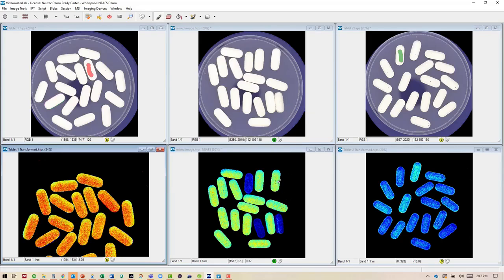By teaching this system, we can use a 5-second analysis and look at this transformation and know immediately that there are tablets in there that aren't supposed to be there, that are counterfeits. We can do this by simply recognizing the tablet 1 type as well, and not necessarily even having the tablet 2 type if we don't know what that counterfeit is going to look like. As long as we've taught the system what the pure is supposed to look like, then we can use this same transformation to find those counterfeits when they're present in a package of tablets.